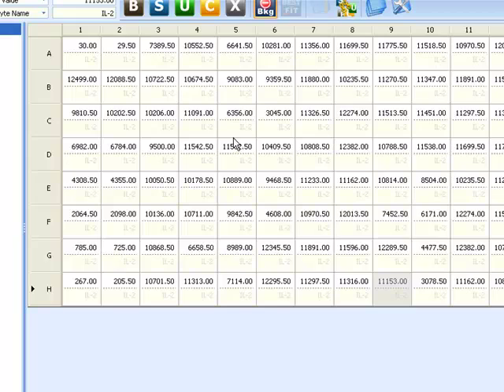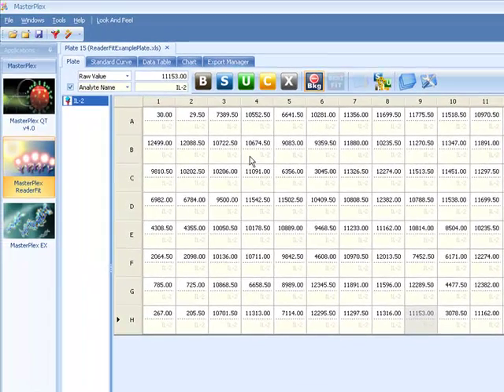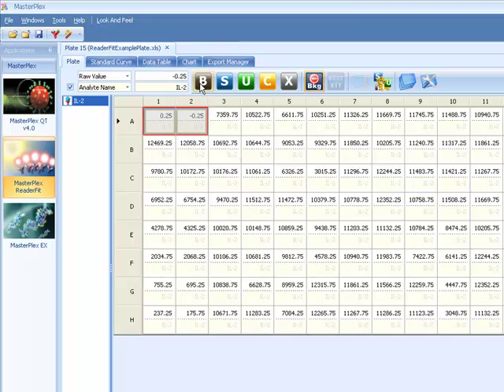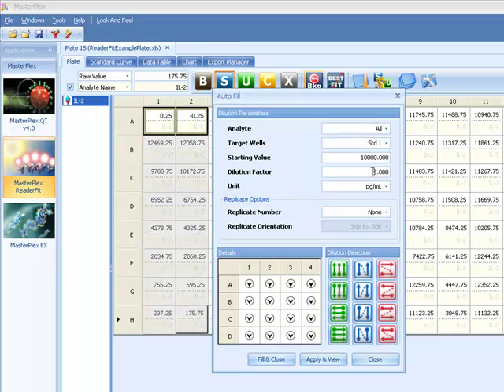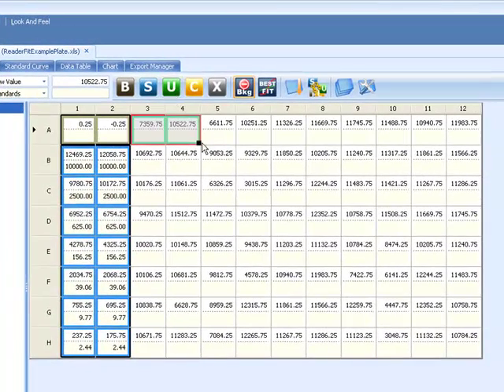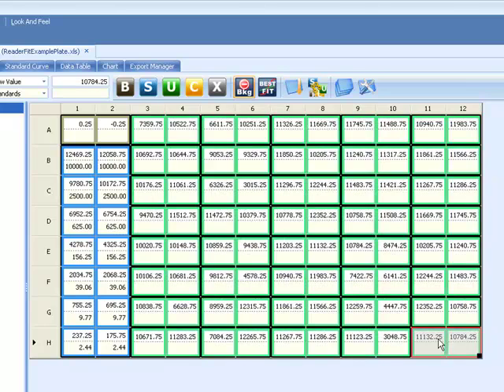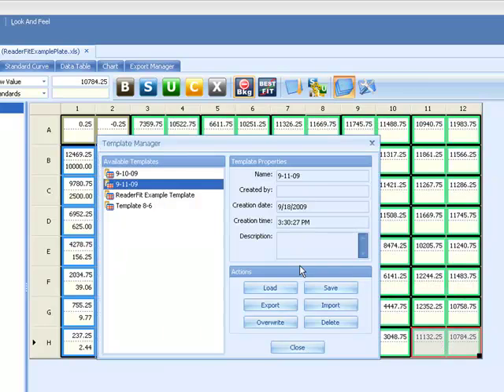It's time to indicate sample type, replicate group information, and standard concentrations. First select background wells, if necessary, and click the background button. Select your standards and click the standard button. A wizard will open to help you input your standard concentrations. Select your unknown replicate groups. This layout can now be saved as a template for similar experiments.